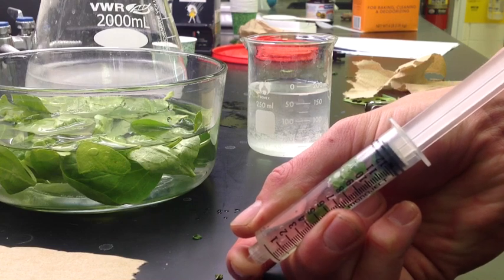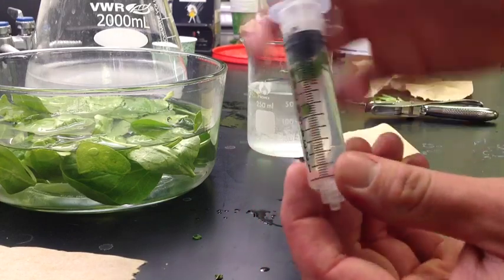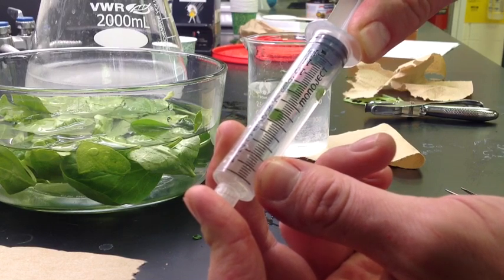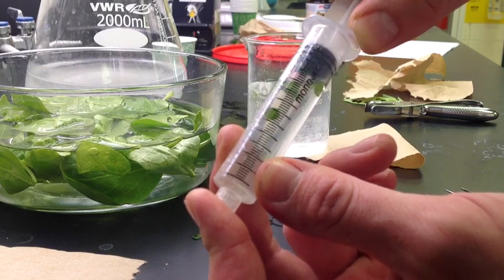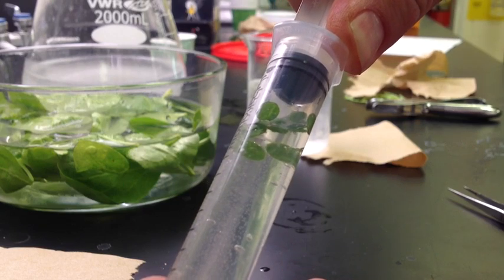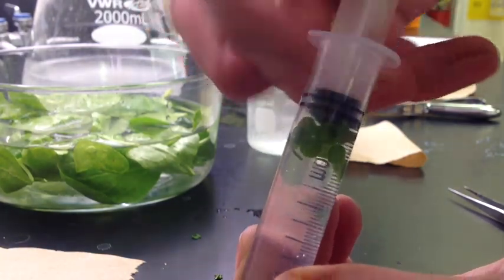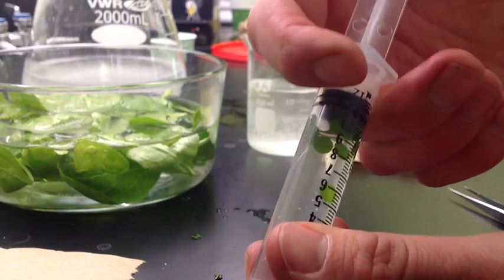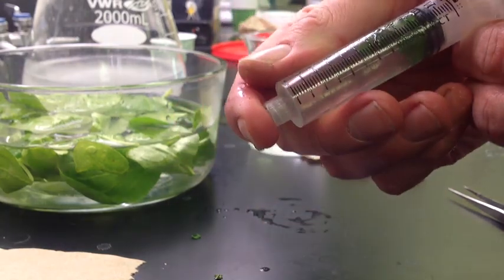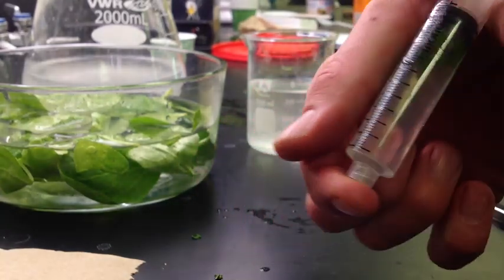Next, lift up on the syringe and try to pull as much of the air out of the leaf discs as you can. If your leaf discs are jammed together, tap them down gently. Placing your finger on the end, pull up on the syringe to suck out as much air as possible — you may actually see the air being pulled out. Keep alternating between pulling the air out and pushing the solution in to eventually make your discs start to fall.